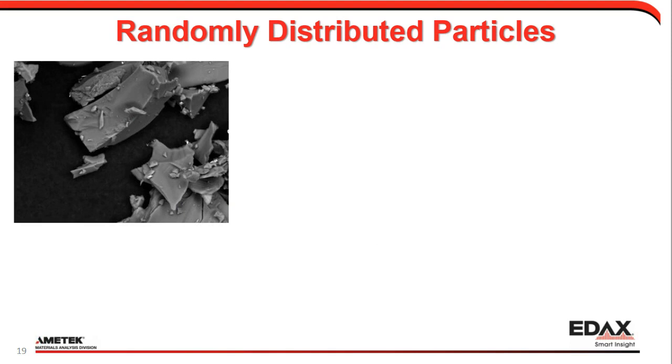Thank you, Jens. Hello, everyone. I'm going to show you some real examples. This one is an EM image. Those are randomly distributed alumina particles.